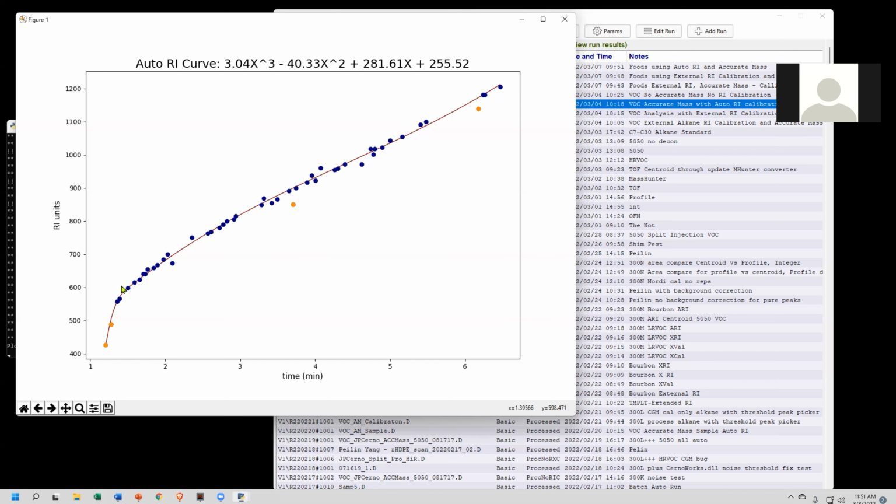So since we average and plot these on the curve, we can identify compounds that don't match the retention index trend, because you expect the retention index to increase monotonically. And so we can look at a compound that has a retention index value from the library that's more than 2 standard deviations away, and we can say, oh, that's an outlier. That's not the right answer.